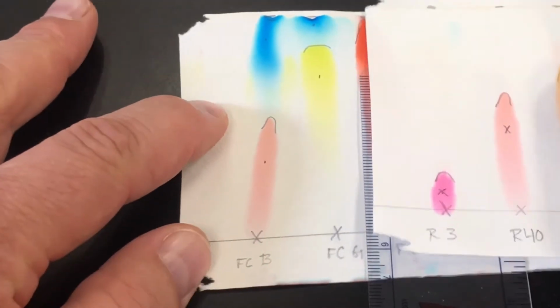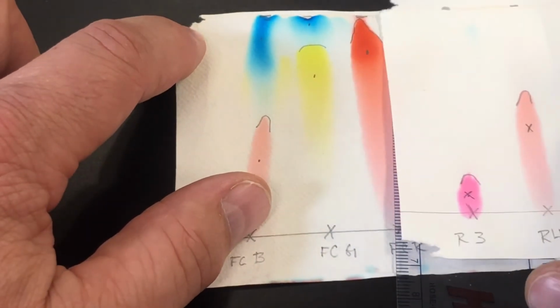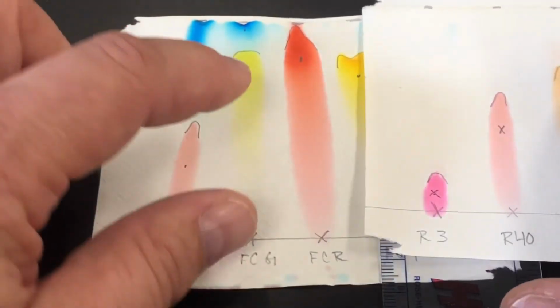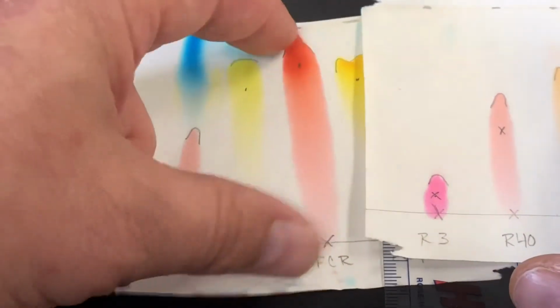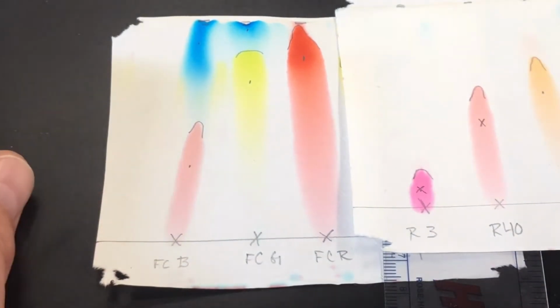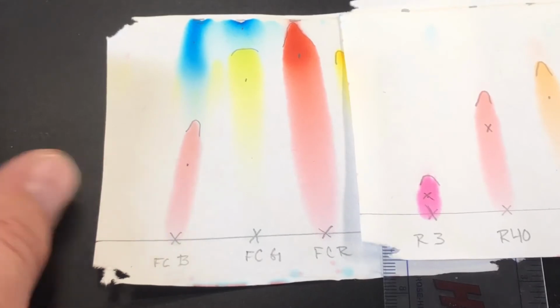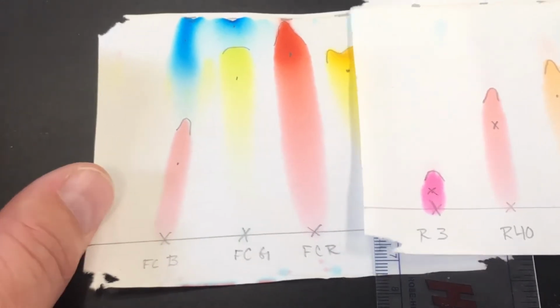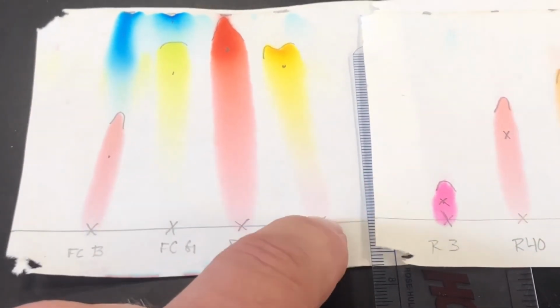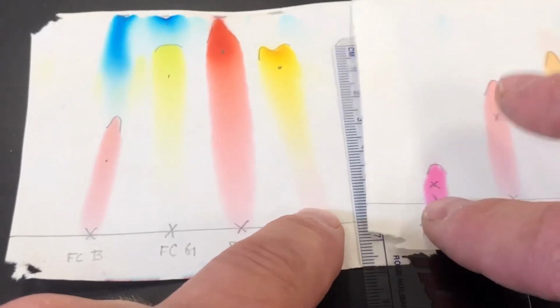And then we had the green, blue and yellow make green. And so, again, not the same kind of yellow. Food coloring red, well, I don't think that it's red 40. Maybe this is a different color of red in your food coloring red, because it didn't just quite match up, did it? And food coloring yellow, notice it does have a tiny bit of red in it though. And this is a little bit lighter red. Maybe that is.